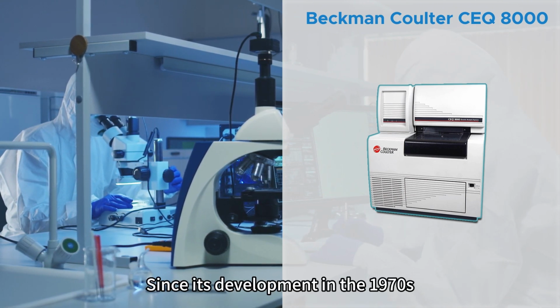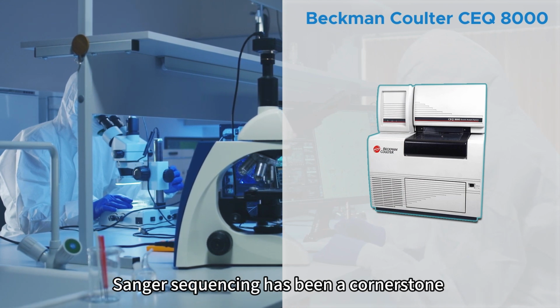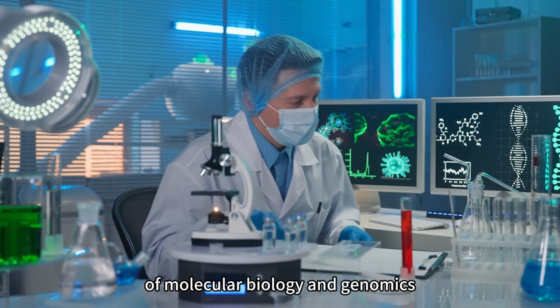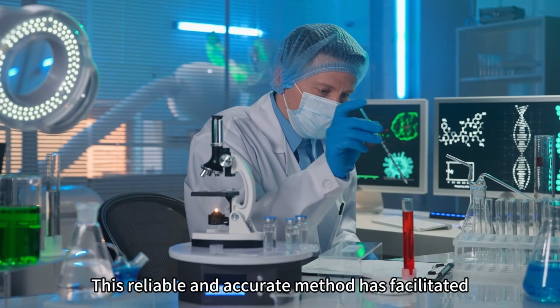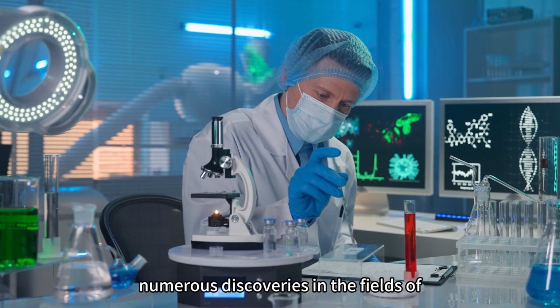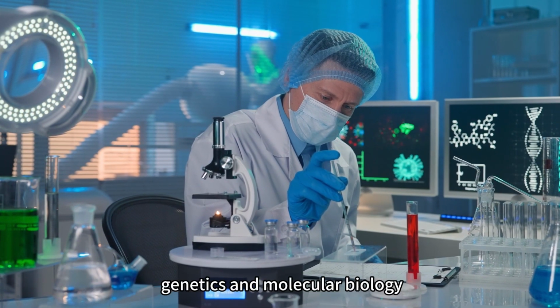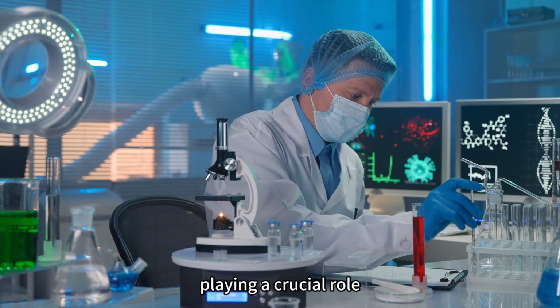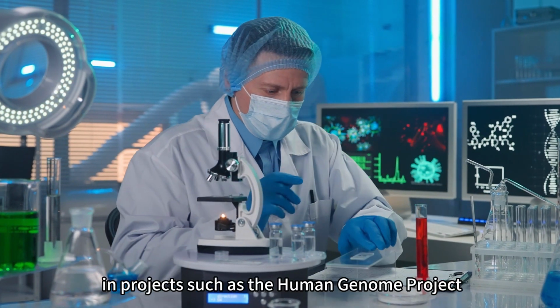Since its development in the 1970s, Sanger sequencing has been a cornerstone for molecular biology and genomics. This reliable and accurate method has facilitated numerous discoveries in the fields of genetics and molecular biology, playing a crucial role in projects such as the Human Genome Project.